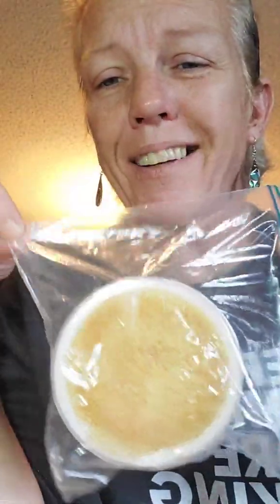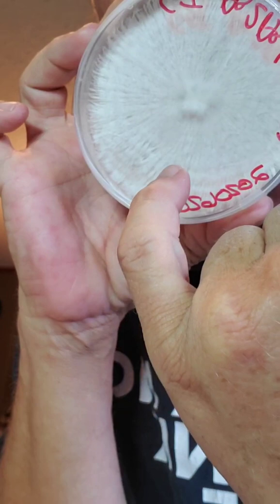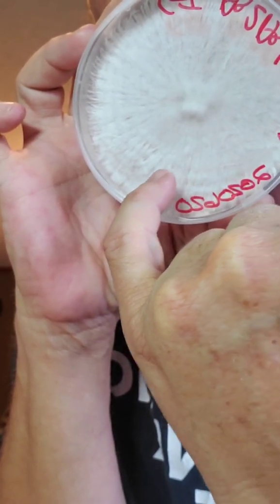You guys all know that mine is pretty rhizomorphic, I know. It looks like, you can't even see it. I call these sunbursts because it looks like just the rays of the sun. This one's actually getting ready to start pinning right in here. This one is getting cultured because it's stacking right here. I'll culture it.